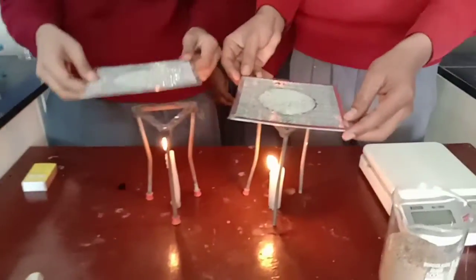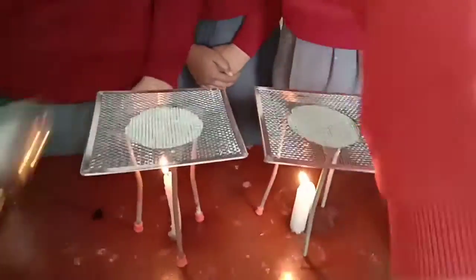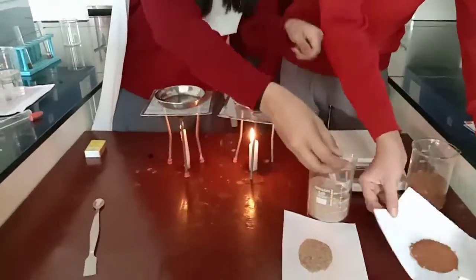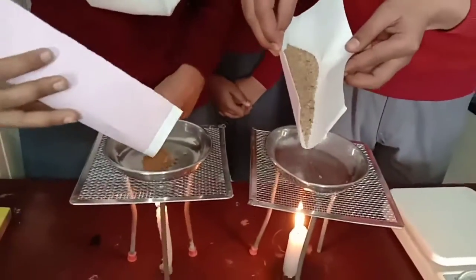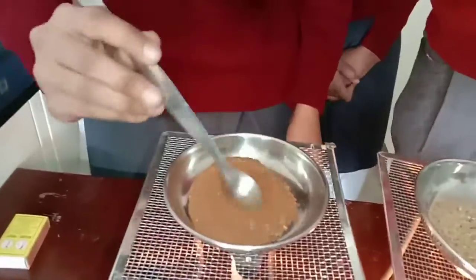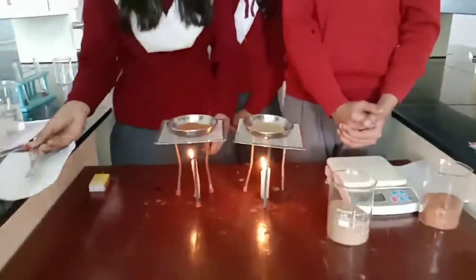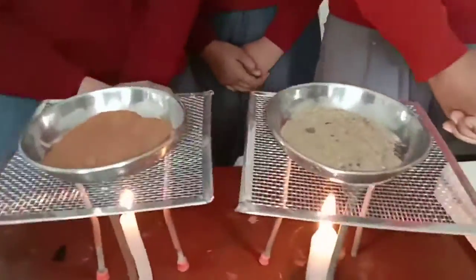We'll prepare a setup like this with the help of burner, tripod stand and wire gauze. We'll put the container over the burner. We'll take our measured 25 grams of soil sample over the container and then we'll heat it gently.